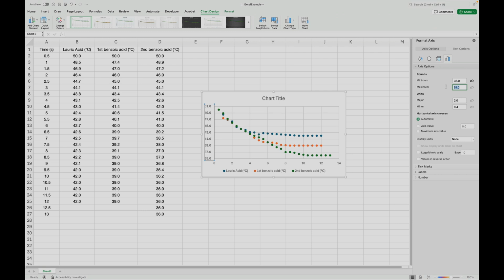And for a high, it thinks 51 is fine. I'm going to make it more whole numbers of 5. I'm going to make it 55 degrees. And you can see now what happens is it does make the graph really nice. Now, to be honest, I think I like Excel's version of 51 better because now we have a little dead space at the top of that graph. So if I change it to 51, yeah, now everything's really good.